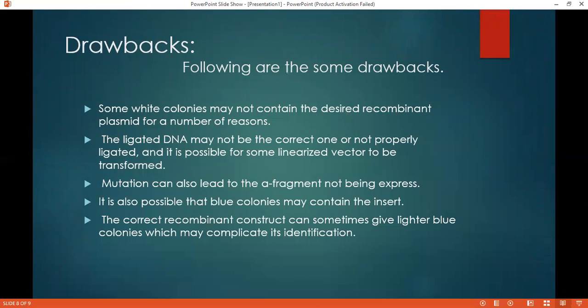There are some drawbacks of Blue-White Screening. First, some white colonies may not contain the desired recombinant plasmid for a number of reasons: the ligated DNA may not be correct, or not properly ligated, and it is possible for some linearized vectors to be re-circularized. Mutation can also lead to the alpha fragment not being expressed. It is also possible that blue colonies may contain an insert. The correct recombinant constructs can sometimes produce lighter blue colonies, which may complicate identification.